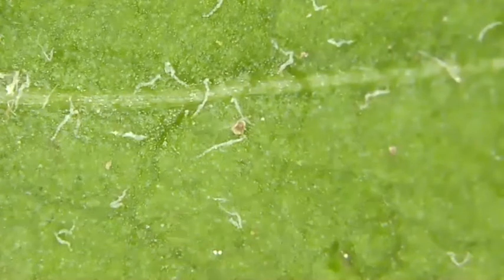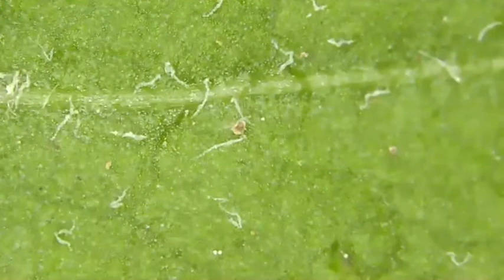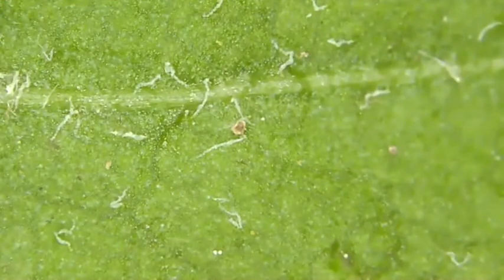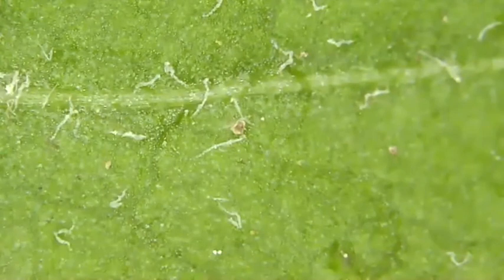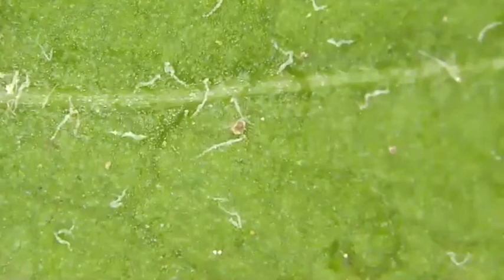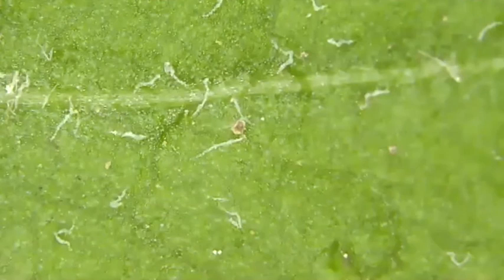Kind of hard to know what plant it's from because it's so close up. But if you want to make some guesses, I'd say milkweed. That's a really good guess. I feel like it's practically impossible for you to guess this though because you're so close up. I think you'd need to know the shape of the leaf to actually know. But Ani, do you want to make a guess? Bean plant. A bean. Say that again.